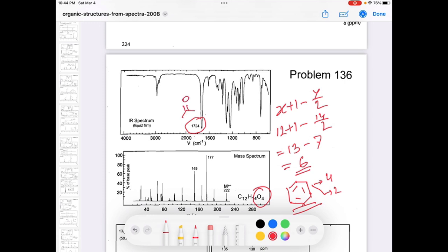Since I am suspecting it could be a carboxylic acid or an ester, in my previous video I said if you have the carbonyl group along with a peak around 3000 to 2500, an ugly broad band like this, that could be the carboxylic acid peak. But here you are not seeing any ugly broad band from 2500 to 3000 in IR. So in your IR there is no carboxylic acid peak here.